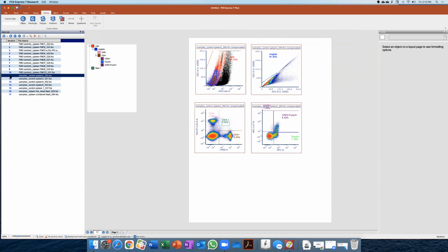Then you might identify that there are primary markers in your panel that are very easily distinguished. If sample quantity or cell number is a concern, you can then say, all right, for markers X, Y, and Z, I don't need an FMO moving forward, because it's able to resolve really easily.